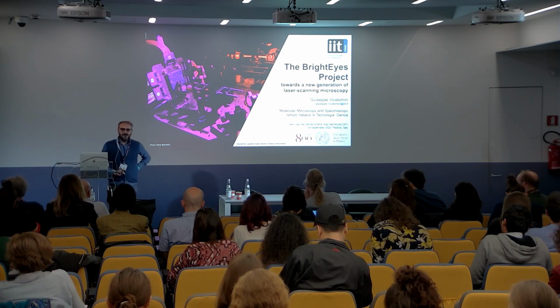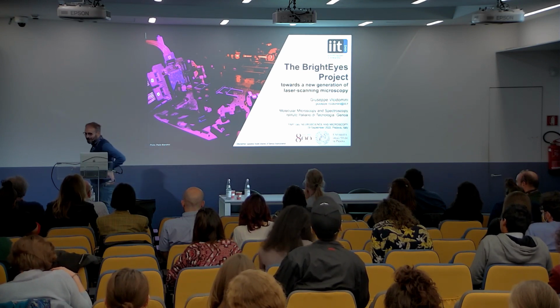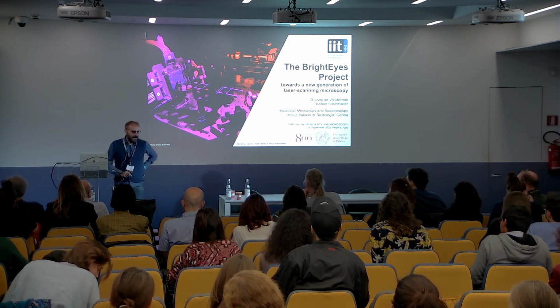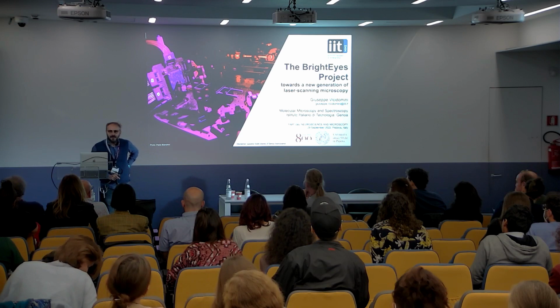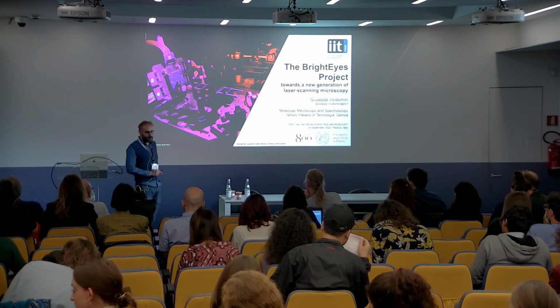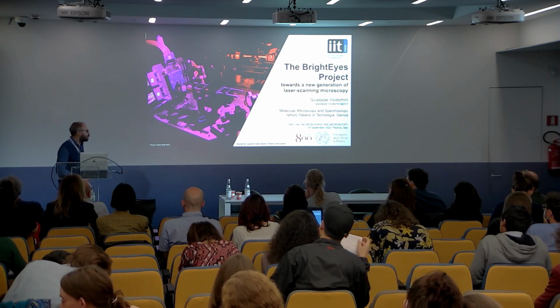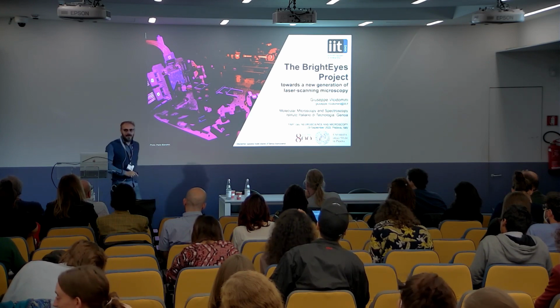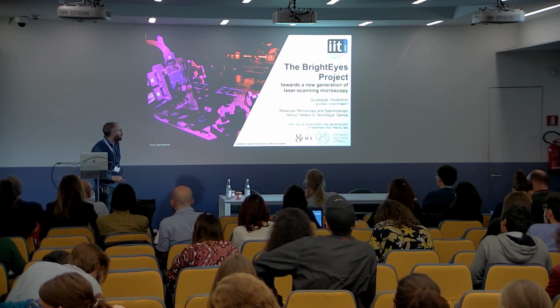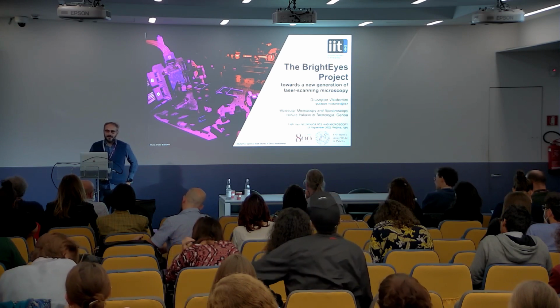A word that maybe has not been mentioned so many times today: quantum. So I think you agree that quantum technology is going to revolutionize many areas of photonics research, and obviously also microscopy, optical microscopy, and fluorescence microscopy. Today what I want to show you is how one of these quantum devices, specifically a single photon detector array, can trigger what I consider a new generation of laser scanning microscopy.